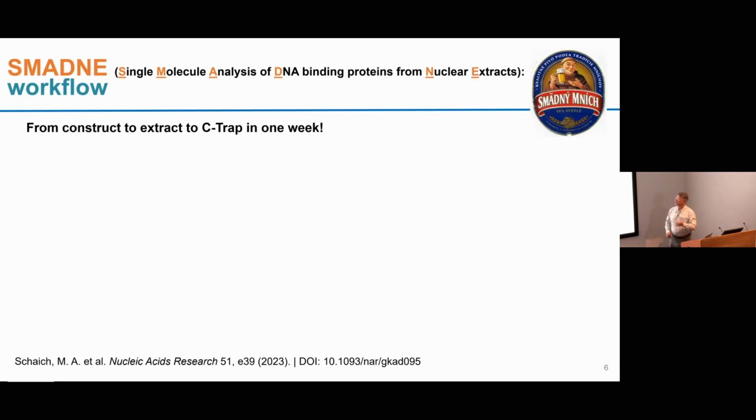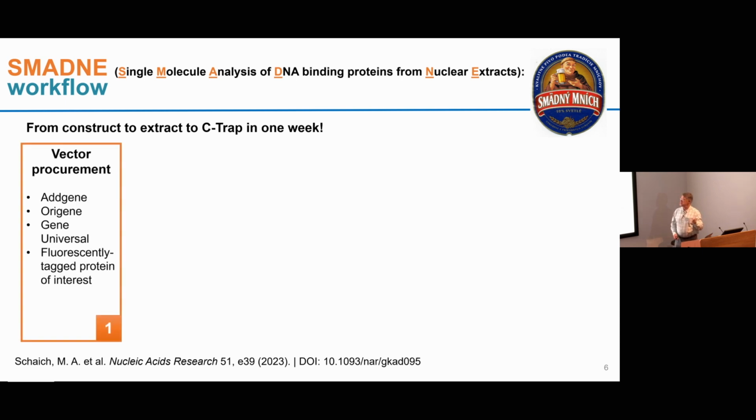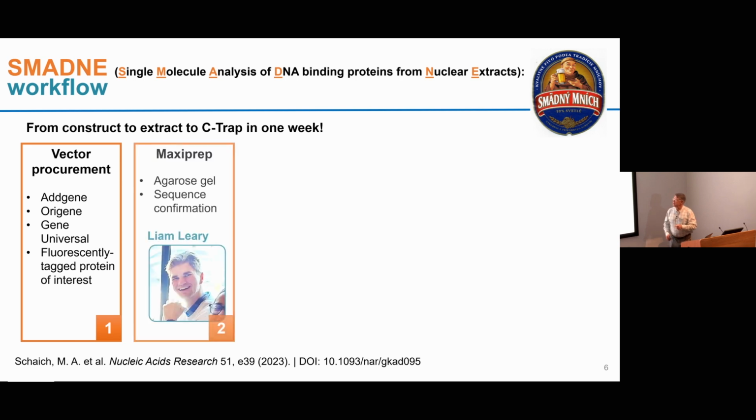So this is the workflow. We get a plasmid or make a plasmid that has a tag on a protein of interest. Had a wonderful undergrad, grew up over 100 plasmids while he was working.